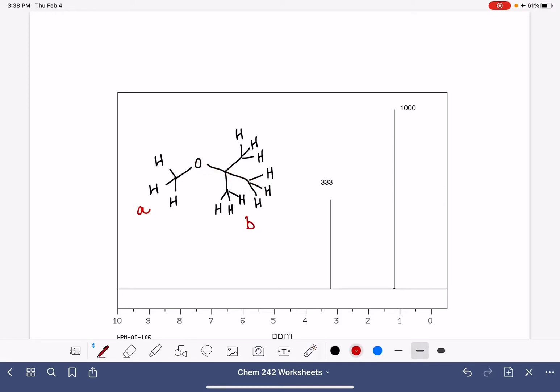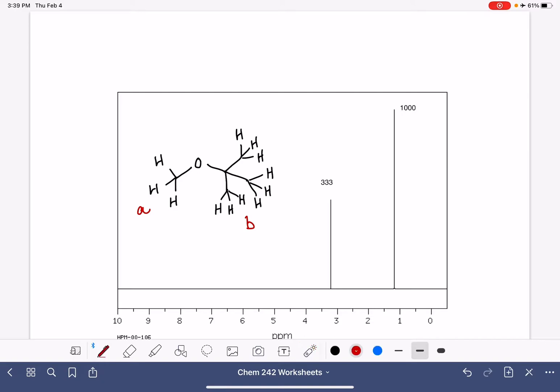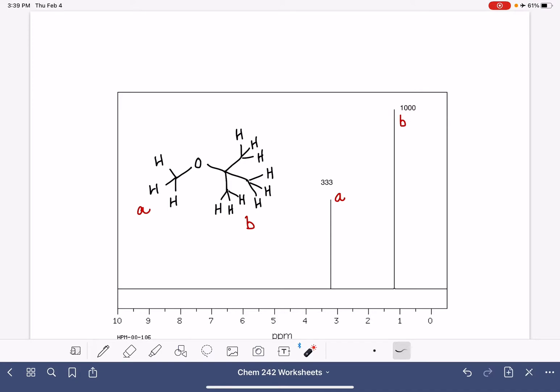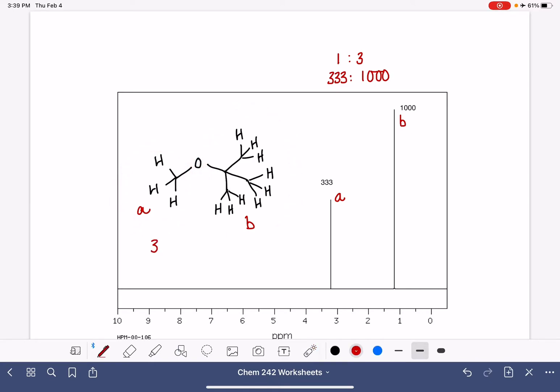Those are proton B. Since protons A are closer to the oxygen atom, they will have a more significant shift — their peak will be further to the left — and that means the other peak must be B. The second thing to look at is the integration. This peak integrates at 333 and this one at 1000. That is a 1 to 3 ratio, which is consistent with what we see: three protons A and nine protons B, also a 1 to 3 ratio.